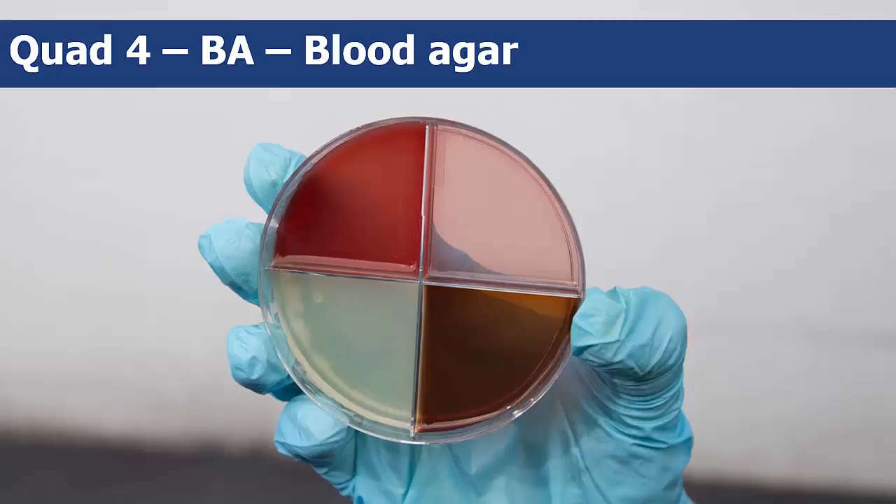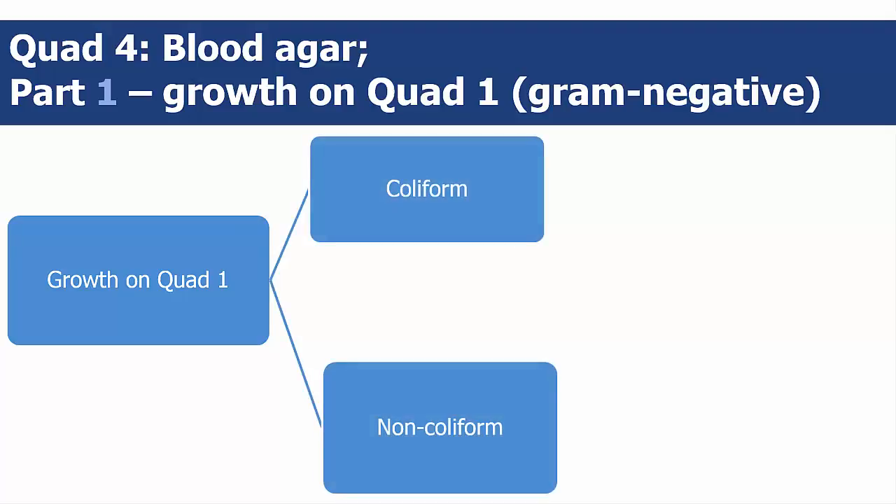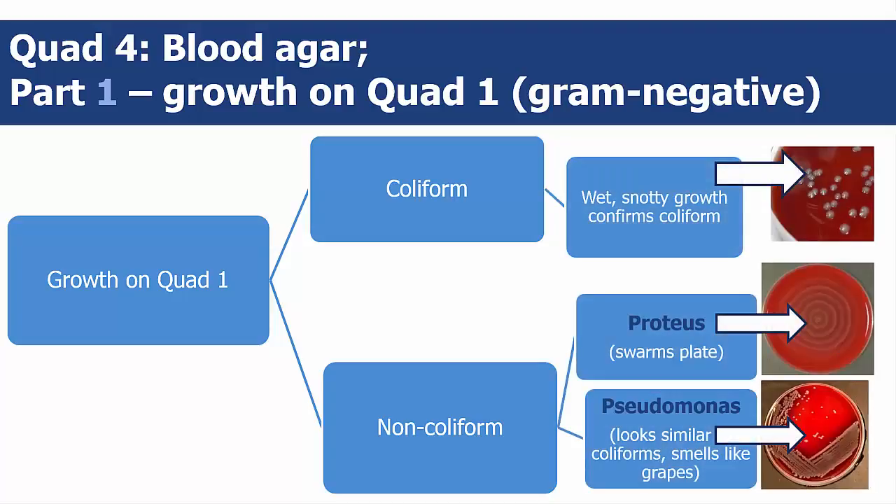The fourth and final quad is the blood agar quad, which confirms the results from the other three quads. If you saw gram-negative growth on quad 1, you should also see growth on blood quad 4. The coliform and non-coliform bacteria grow differently, and you will be able to differentiate between the two non-coliform species as well.